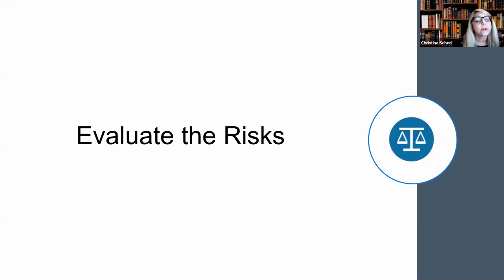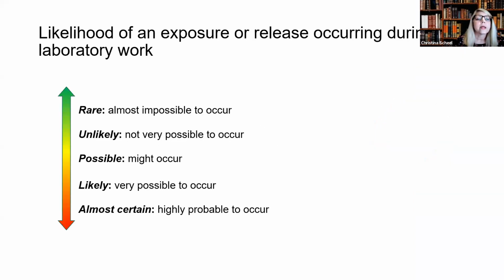Over the next several slides, I'll be talking about evaluation of the risks. And so I have this as a single slide to let you know there's probably 6 or 7 slides that follow this that talk about this topic. And that was the second step.